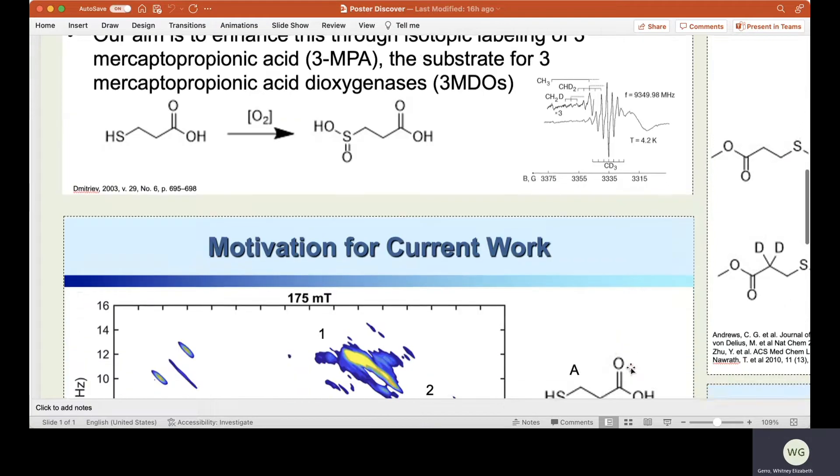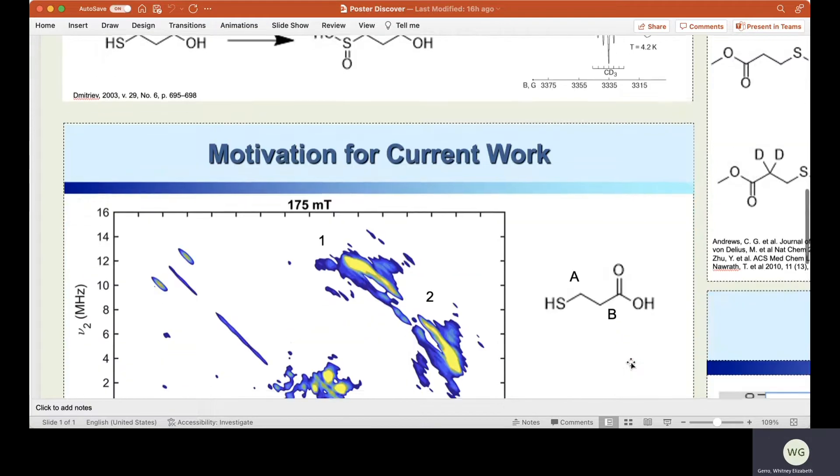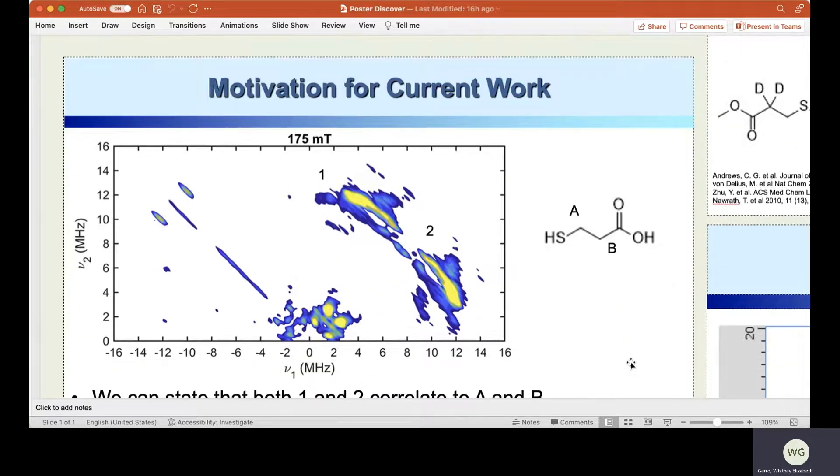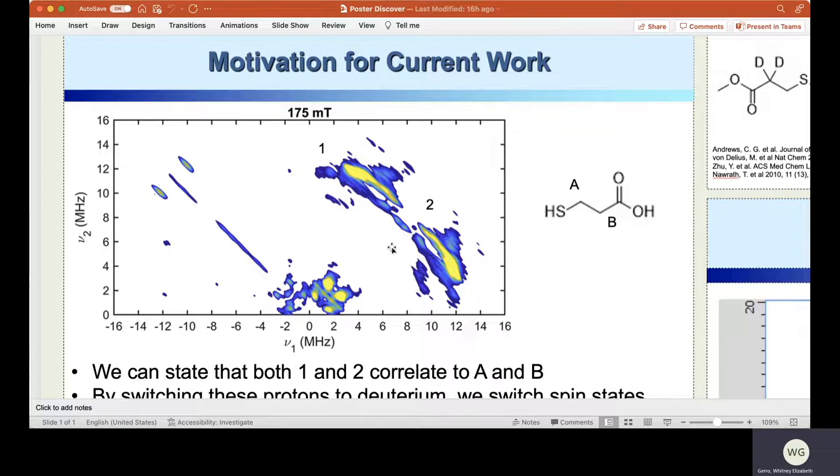Our collaborators at the University of Alabama sent us this HYSCORE EPR spectra. This peanut-esque blob here showing the two spots, which we've labeled 1 and 2, is where we can see splitting as a result of iron in the substrate enzyme complex. The 1 and 2 correspond with carbon A and carbon B on our labeled molecule. The issue, however, is that we are unsure which spot corresponds with A and which spot corresponds with B.